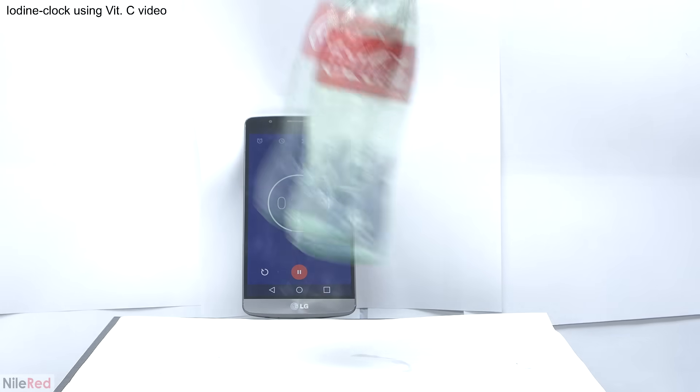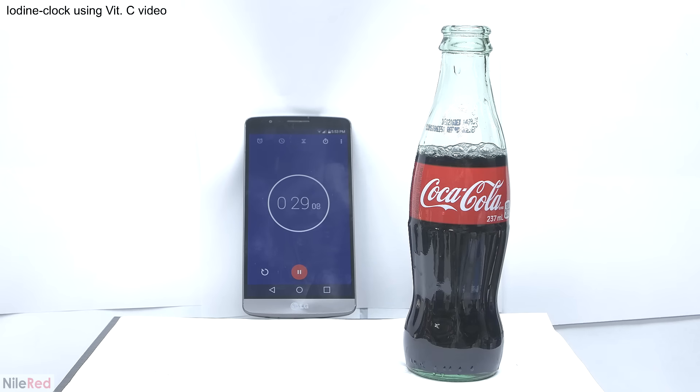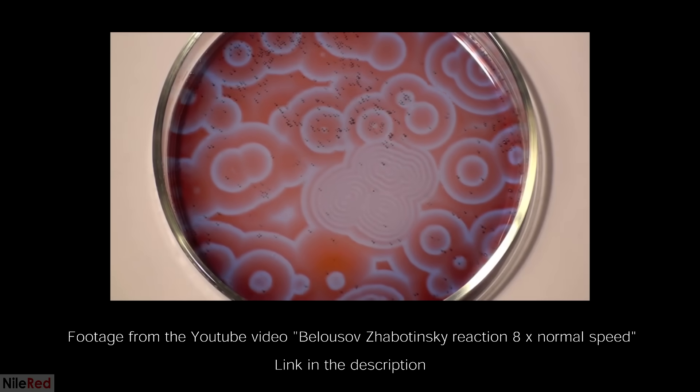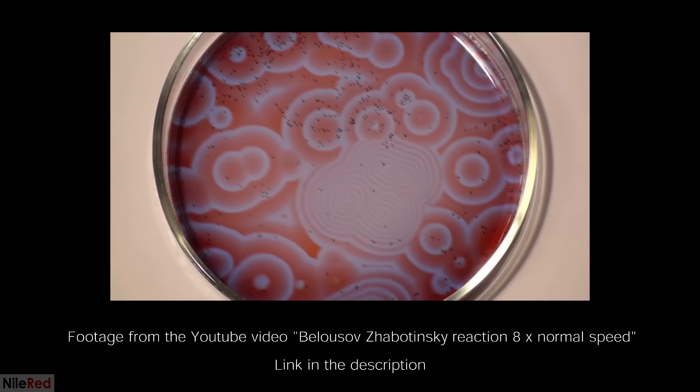However, the iodine clock doesn't oscillate and the reaction is over once it changes colors. There's another famous oscillating reaction known as the Belousov-Zhabotinsky reaction and I plan to cover it in a future video.